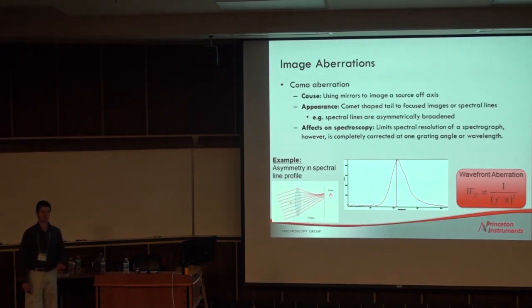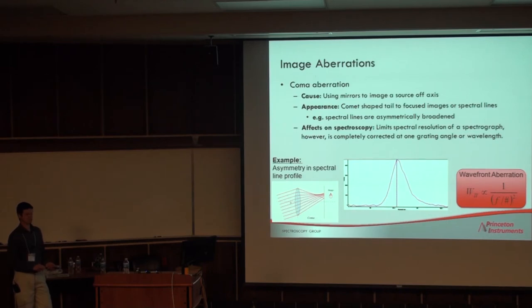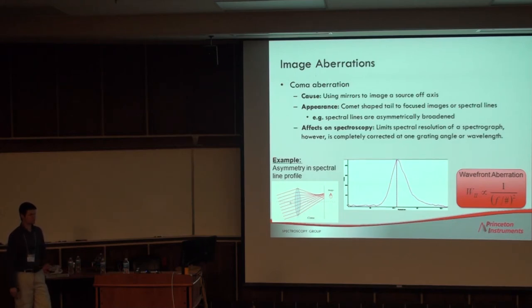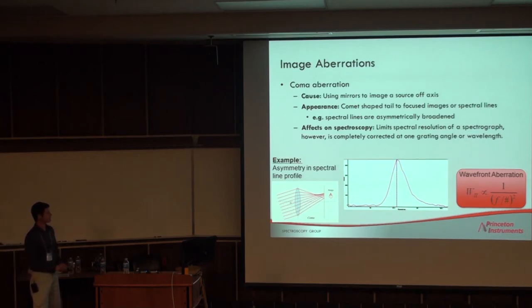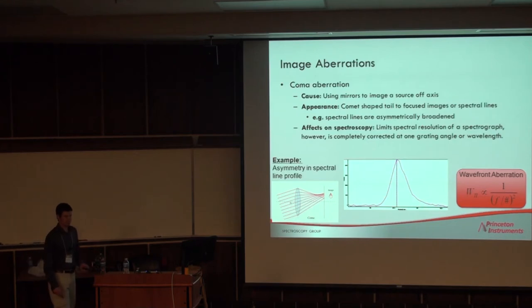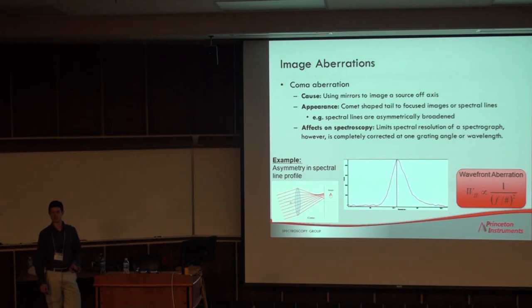Comatic aberration: if you've collected a spectrum of an atomic emission lamp through a traditional Cerny-Turner spectrograph, at some wavelength you probably saw the peak looking asymmetric — that's caused by coma. Coma comes from using any lens or mirror at an off-axis angle, and because we don't punch holes in the mirrors in a spectrograph, we have to use them off-axis — ergo, there's going to be coma.